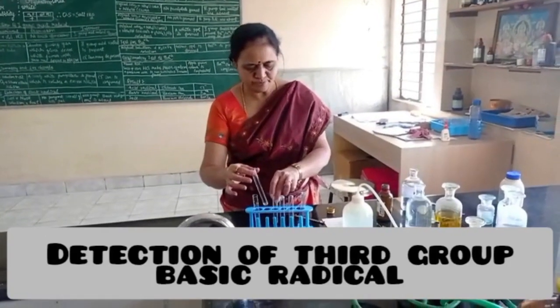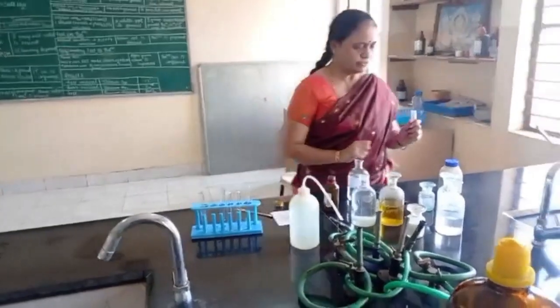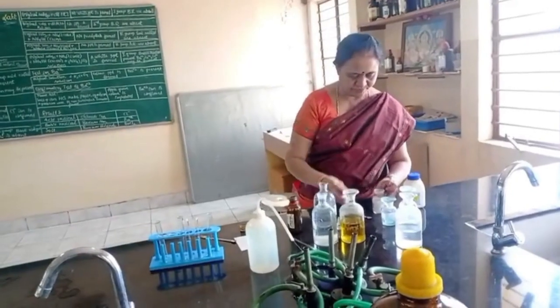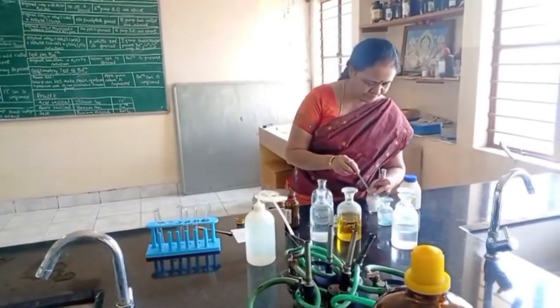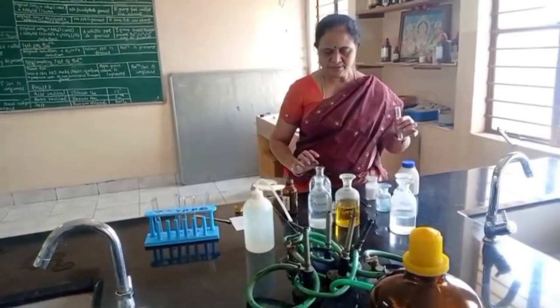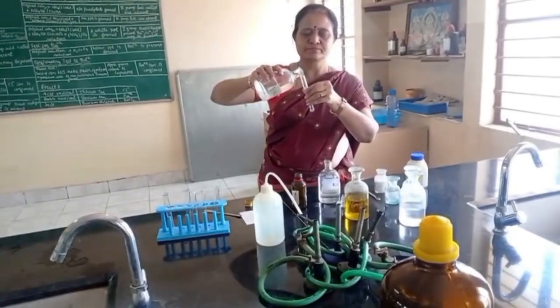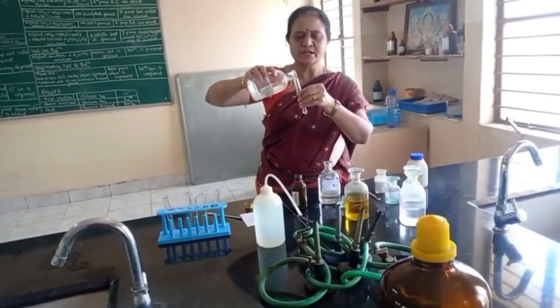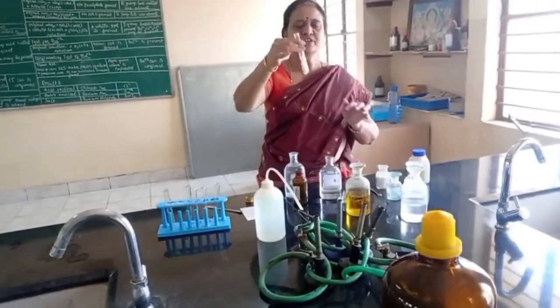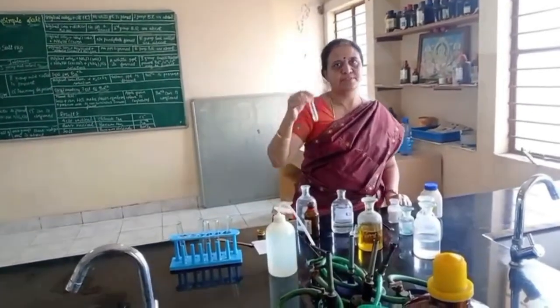See here, for third group basic radical, I take original solution. For this original solution, I am adding solid NH4Cl. Then for this, I am adding excess of NH4OH. See here, original solution, solid NH4Cl and adding NH4OH solution, excess. No precipitate, third group basic radical absent.